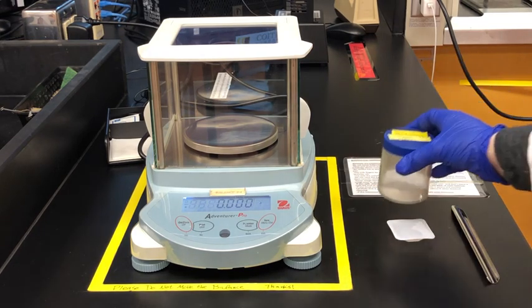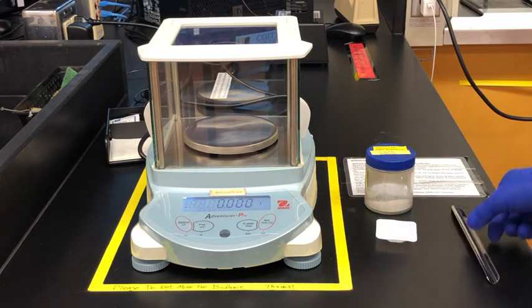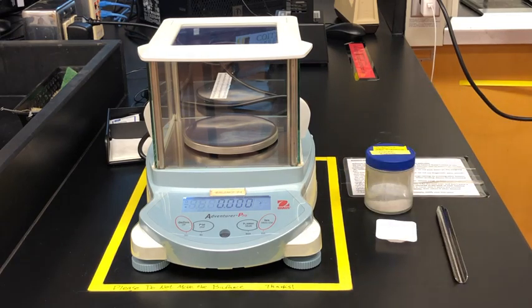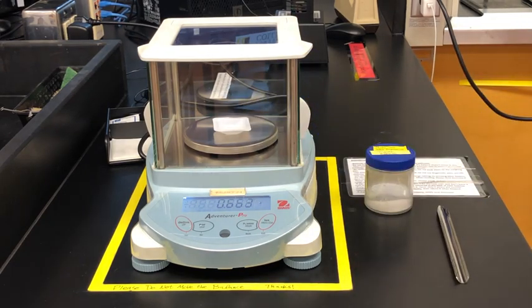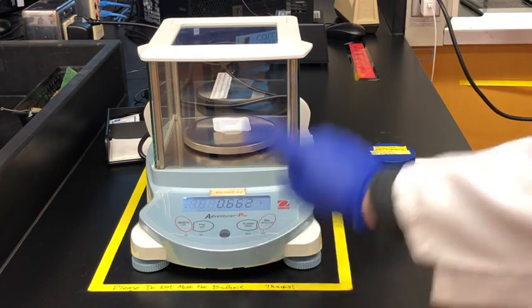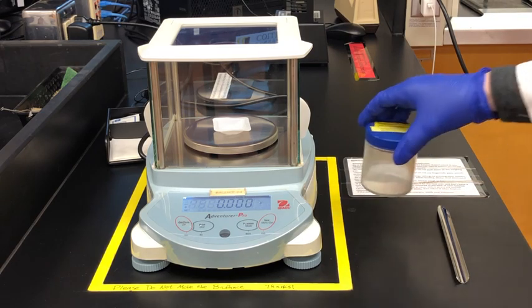First we're going to weigh out about 0.25 to 0.3 grams of impure aspirin into a weigh boat using a spatula and our balance. I'm going to place the weigh boat on the balance and zero the balance or tare it, and that's going to allow us to place our sample directly on the weigh boat and see how much just the sample weighs.